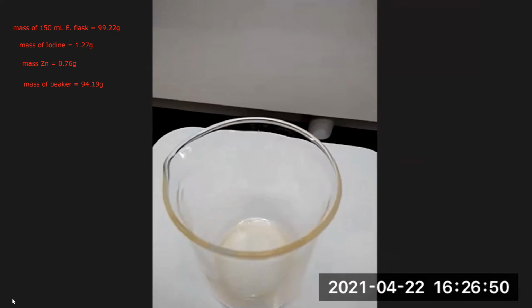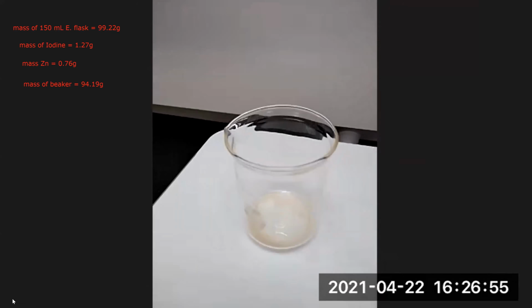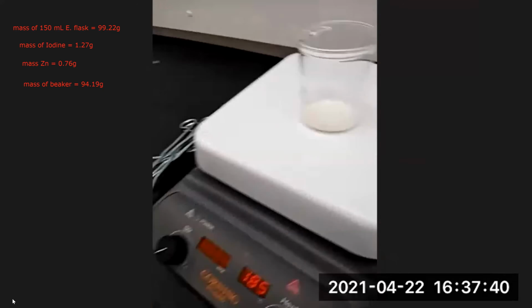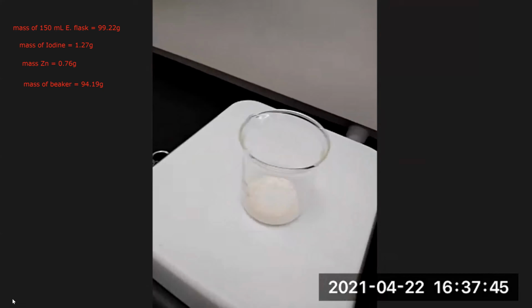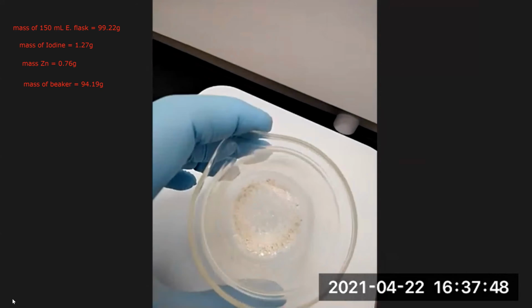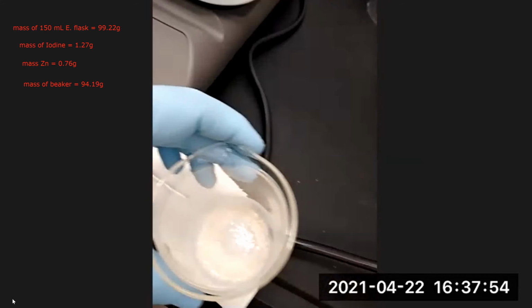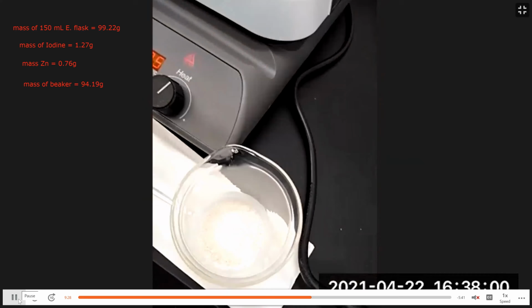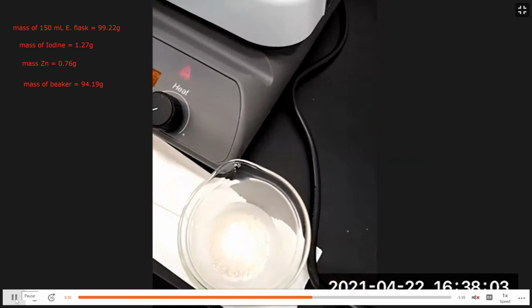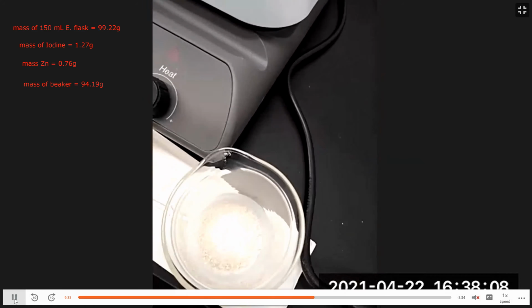So here we're evaporating off the methanol, and as you evaporate it off, you get a creamy off-white solid. Once it's done, we're going to cool it down and record the mass of the product. Make sure you use beaker tongs if the beaker is still hot. So there's your product, an off-white or creamy white color. That's the zinc iodide product for your reaction. We dried the unreacted zinc in the oven.